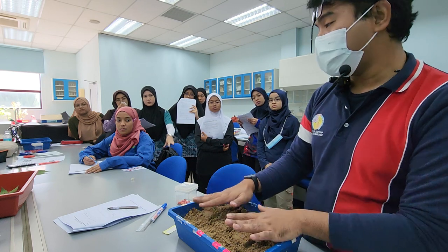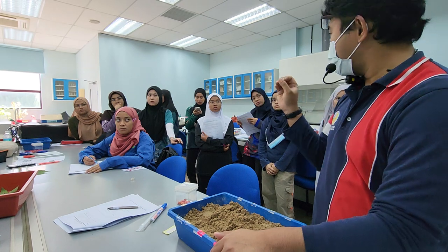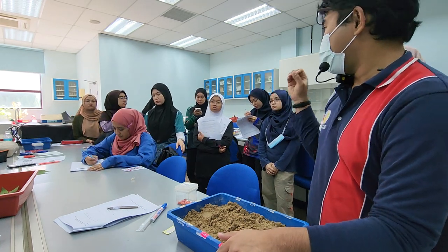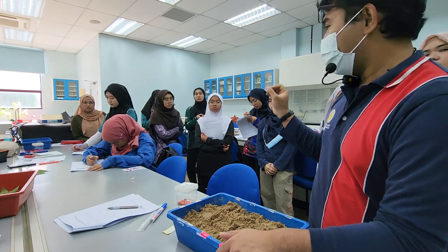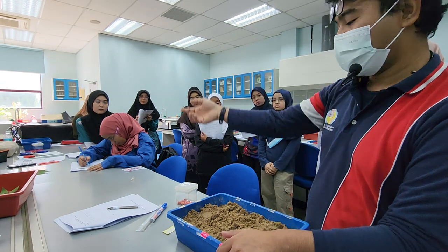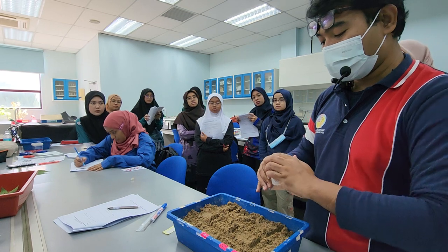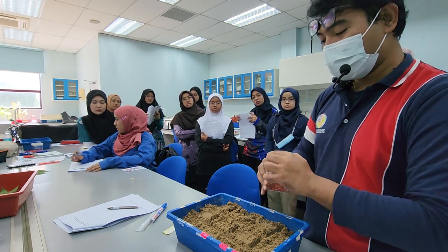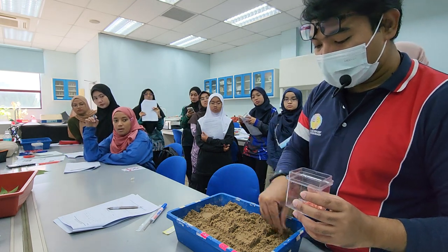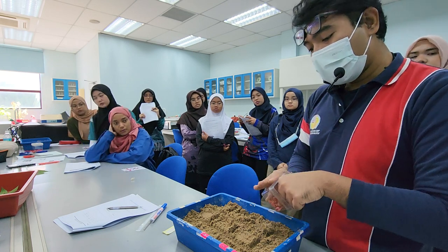nicely placed in this tray, because each week you need to harvest 10 seedlings. Okay? If you manage to finish at week number 2, then that's good. If it's not good, at least you got the extra 10 seedlings for the coming week. Have you grown corn before? So this should be easier. If your soil, this is just sand, is dry, please add some water.